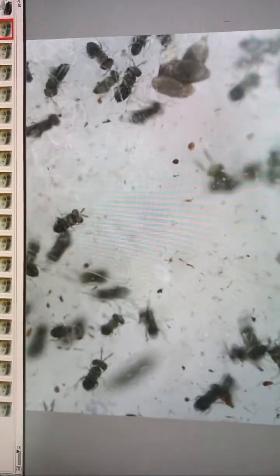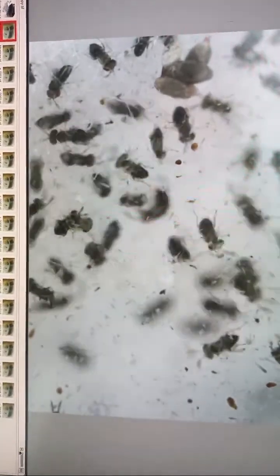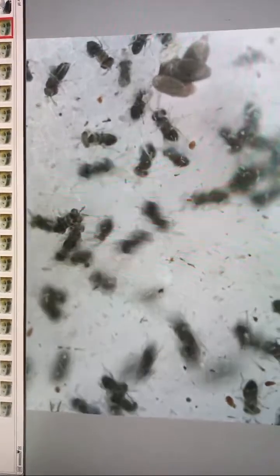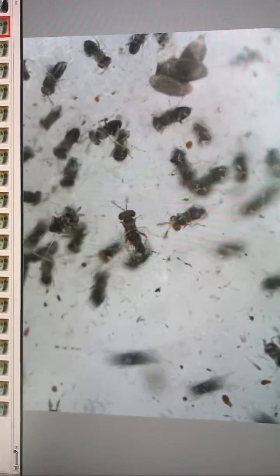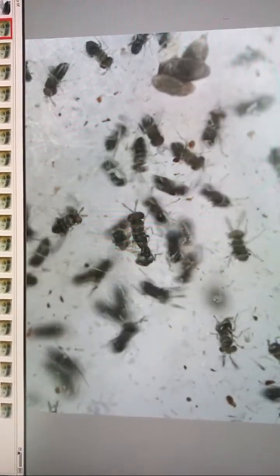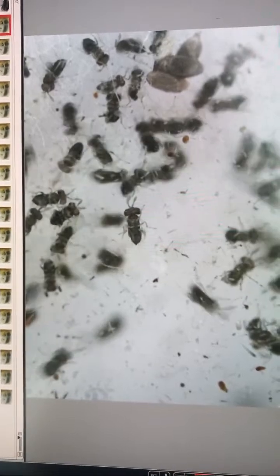And to receive organic production in organic agriculture, some farmers are using natural biological control. For biological control, they can use microorganisms against some fungi, and we can also use biological control of pests, such as maize moth, using egg parasitoid Trichogramma. Now in the central part we can see 2 small female and male mating. All together I can try to make bigger magnification.